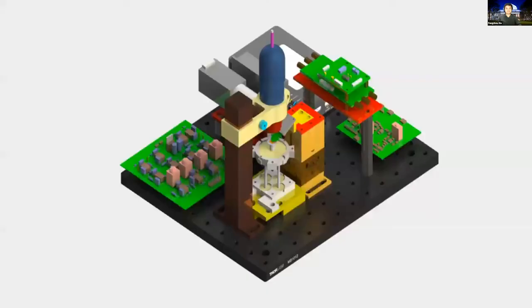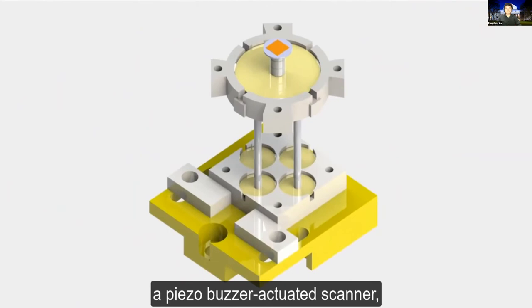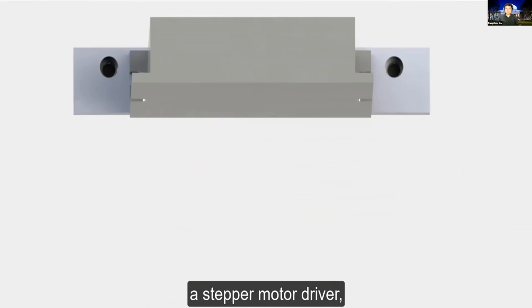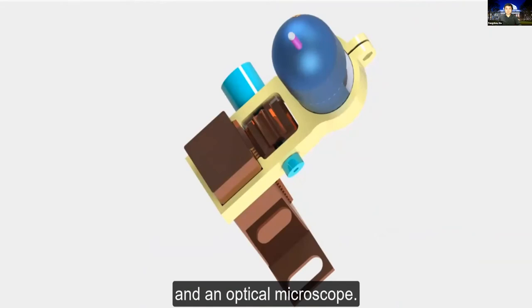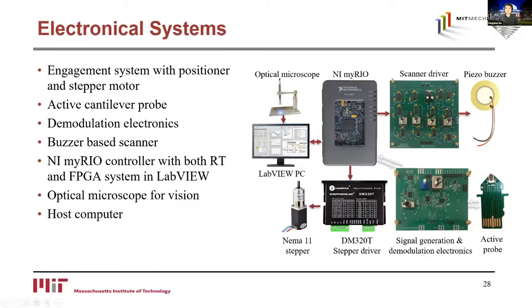The educational atomic force microscope design has nine primary subsystems: a piezo buzzer-actuated scanner, an active cantilever probe, a Wheatstone bridge amplifier, a signal generator and demodulator circuit, a National Instruments MyRIO, a stepper motor driver, a coarse positioner engagement system, a buzzer scanner driver circuit, and an optical microscope. The design is modular, low cost, easy to operate, and suitable for a variety of experiments. The AFM can be used as a platform for precision instrumentation education. The electrical subsystems include the engagement system with positioner and stepper motor, active cantilever probe, demodulation electronics, buzzer-based scanner, MyRIO controller, and optical microscope for vision with a host PC.